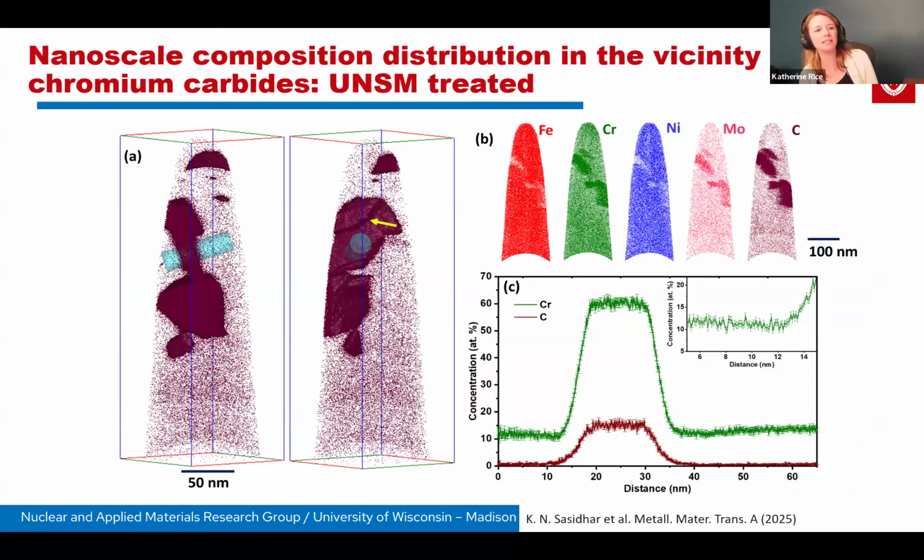How do you select the psi angle when performing the residual stress measurement using a sine square method? Yeah, so it's the classical sine square psi method. When you have standard methodologies that are documented in the literature, you measure a given peak, any peak that gives good intensity, like a 111 or any peak of your choice, and then you measure that at a range of psi angles.